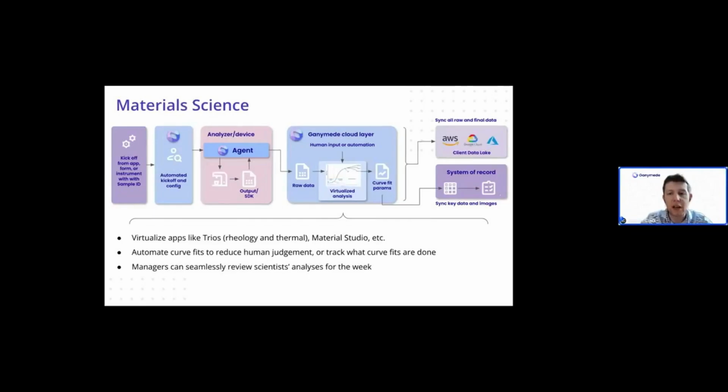And finally, there's many, many use cases for this, and virtualization is especially powerful for some of the more niche, uncommon analyses that people may be doing or in specific fields. Many of the most common applications are pretty cloud native and cloud-based these days, so may not require this. But in more niche fields, technology often lags behind.